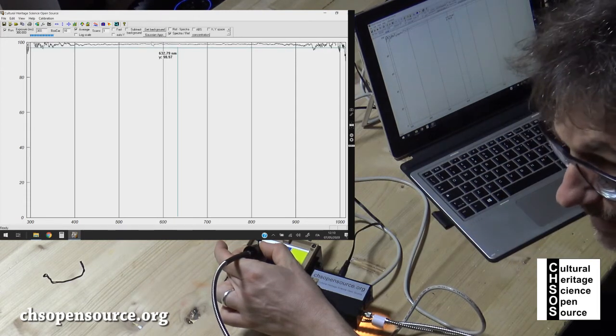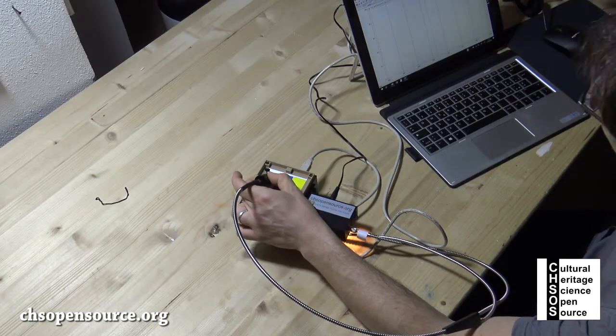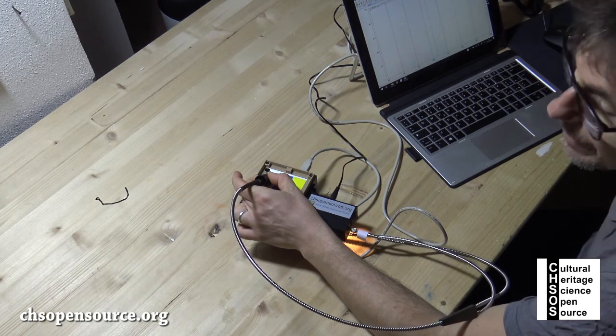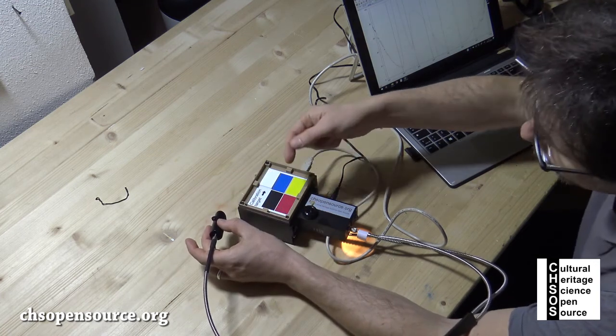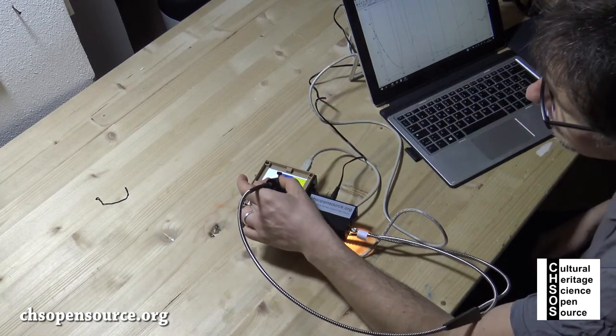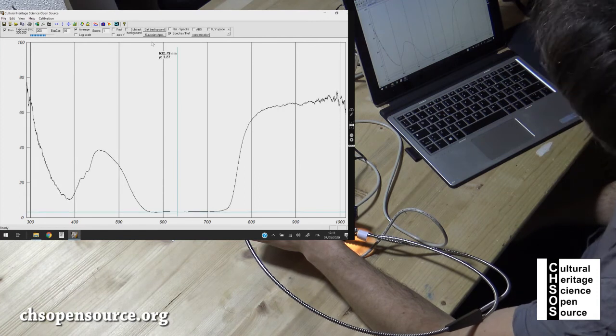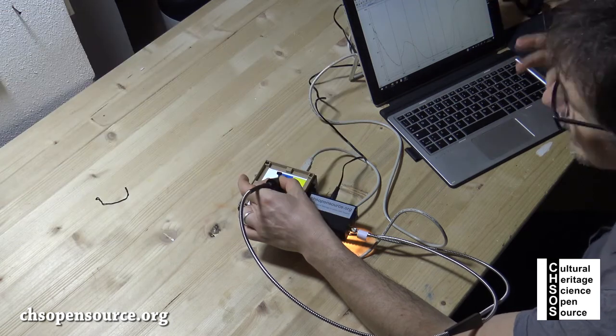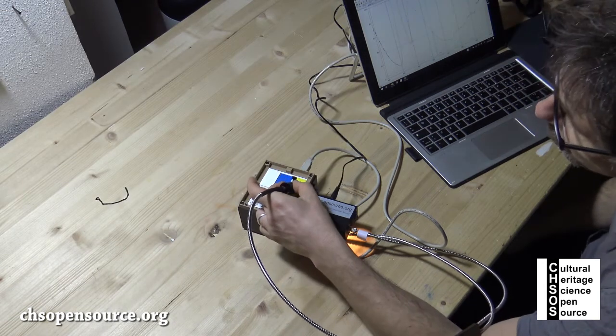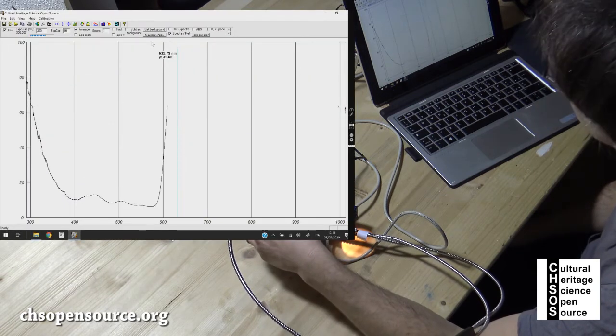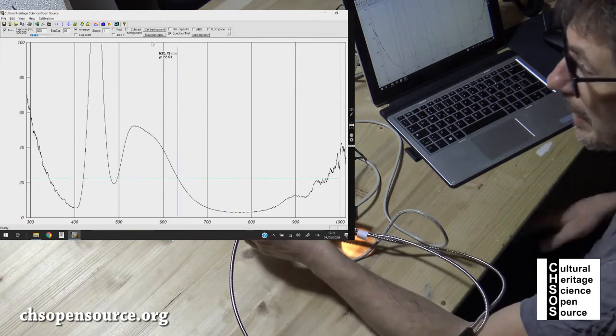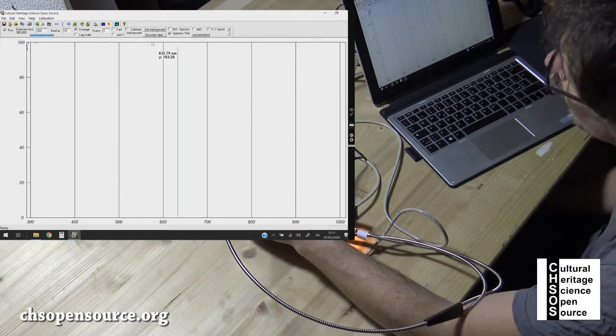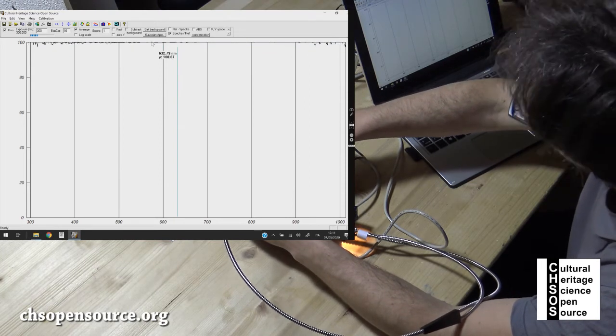At this point we move our cursor over here and we need to check this 'spectra/reference'. Now what we see is this flat line at 100%. This is our first reflectance spectrum. The values on the y-axis go from 0 to 100. Since this white card is our reference white, our standard white, we expect it to be flat at 100%. The system now is basically working.